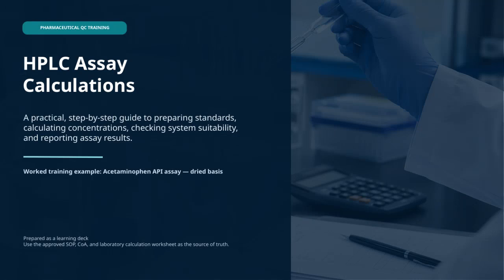Today, we'll focus on HPLC assay calculations using a practical training example based on acetaminophen API. It's essential that all method data is carefully verified against the approved standard operating procedure, certificate of analysis, and the relevant calculation worksheet to ensure accuracy and compliance.